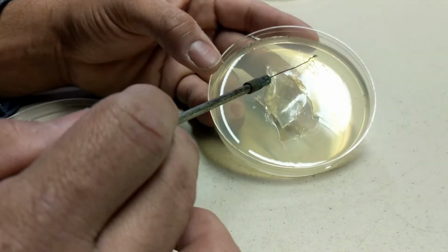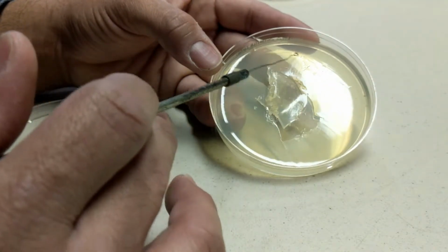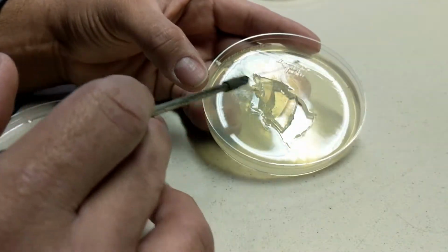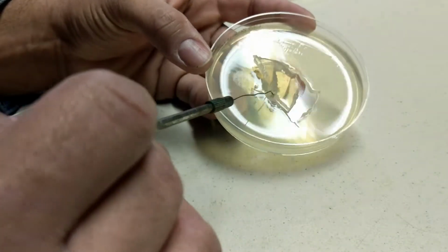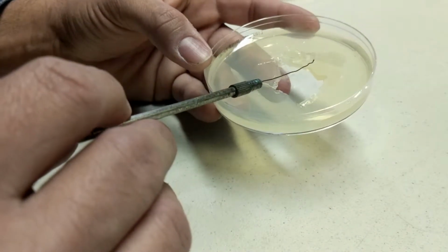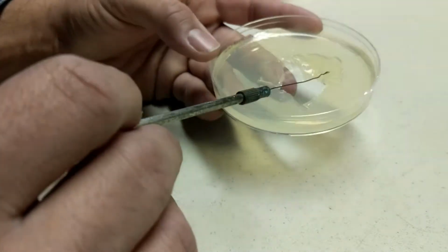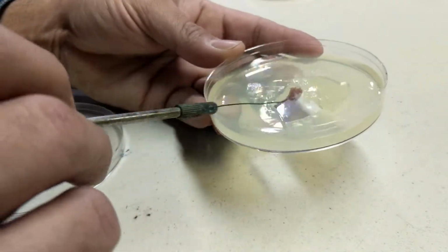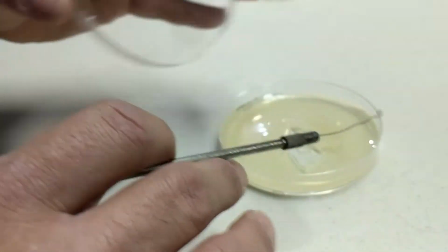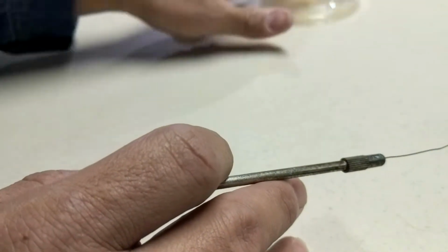But if you do it smoothly on the top, you don't break the agar. These plates are a little bit old, a little bit dehydrated. Sometimes it's a little bit thicker than that, but they're fine. I just want you to at least see that.